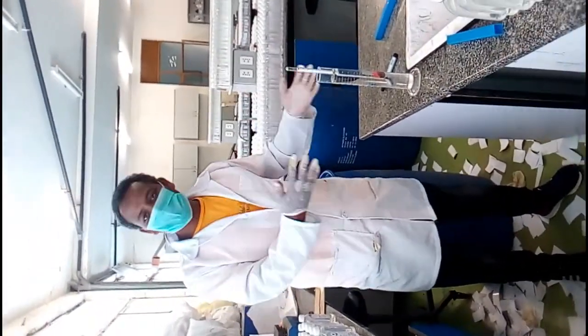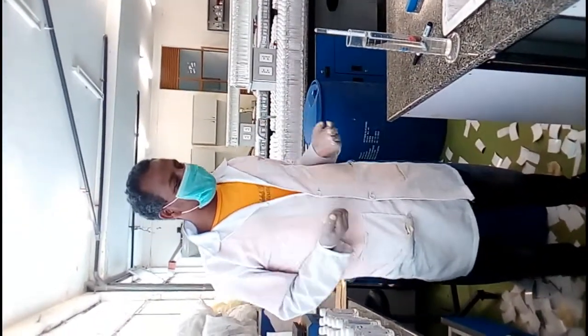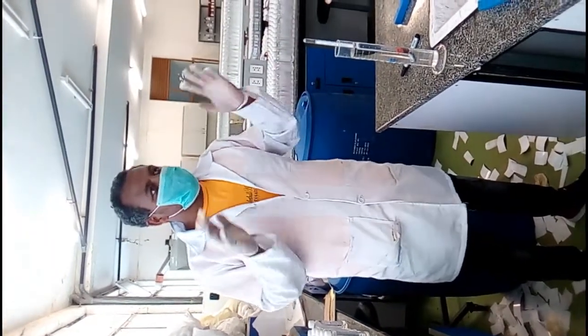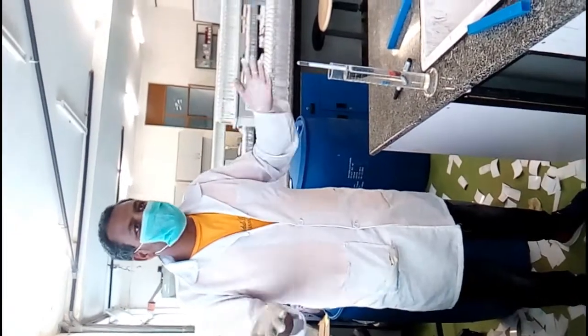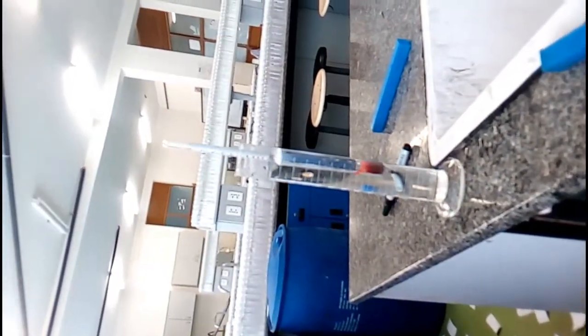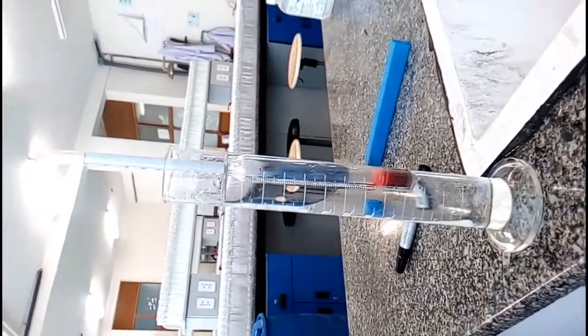Okay, let's come to the principle of this alcohometry. Whether it works properly or not, we can check by using different types of solvent. In our case, our main target is to check the alcohol content of a given sample. For example, let's take the water sample and check whether it contains alcohol or not. Let's come to the reading here. Approximately, where you observe here, it shows 0. This is almost 0.